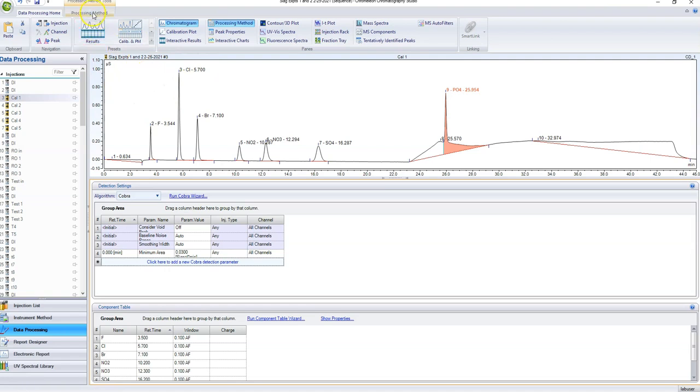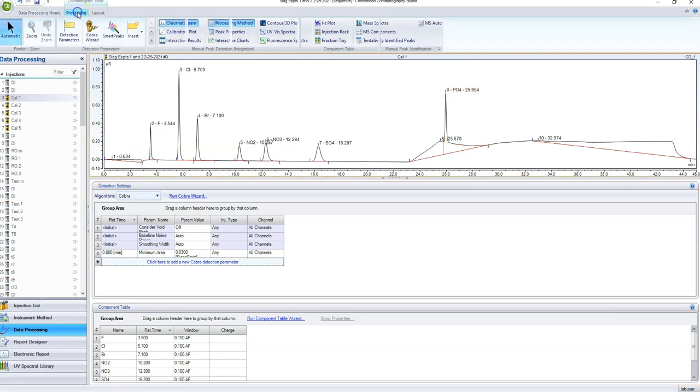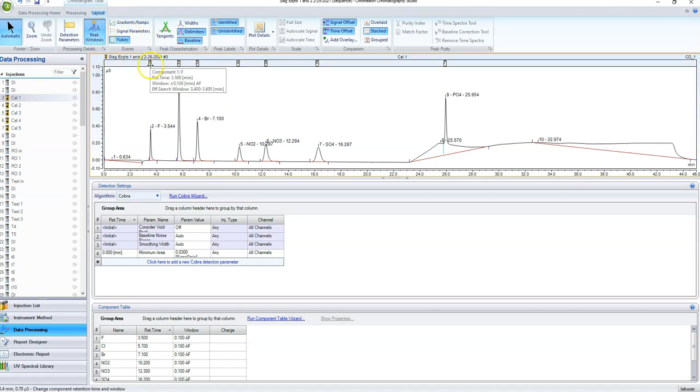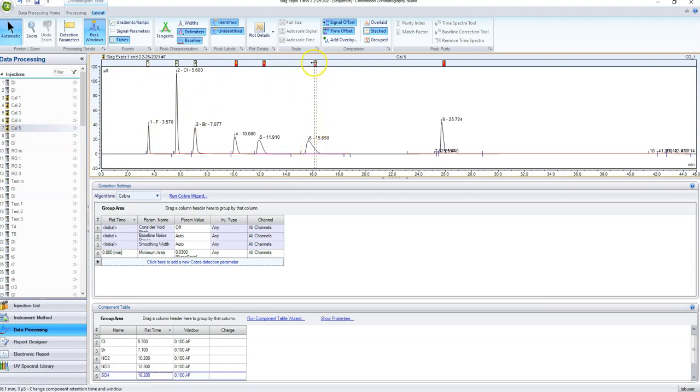Now, a useful tool up here, because sometimes these peaks do move a tiny bit, is going to be this. It's peak windows. So let me find it. Layout. We want peak windows to show up. So now this is how we can widen those ranges, and we want to widen them. See how it didn't actually get our highest peak? We want to widen it to our highest concentration and make sure that it goes from base to base of our highest concentration. Now that is adjusting it right here, right? That's adjusting this window every time I change it. And this is just to make sure that over the range of concentrations that we use in our samples and that we used in our calibration curves, it is going to detect all of the peaks.